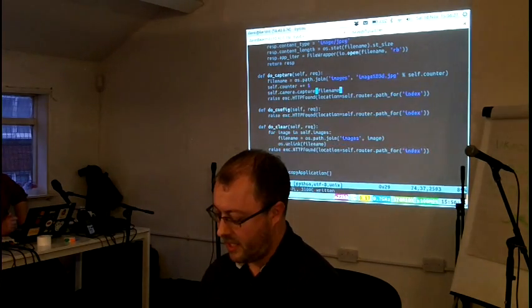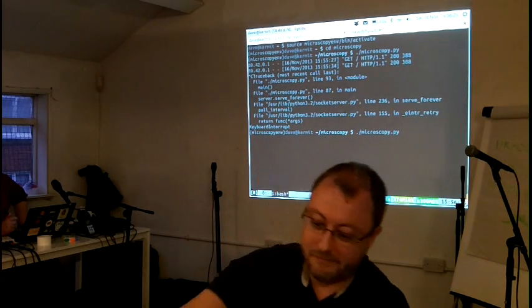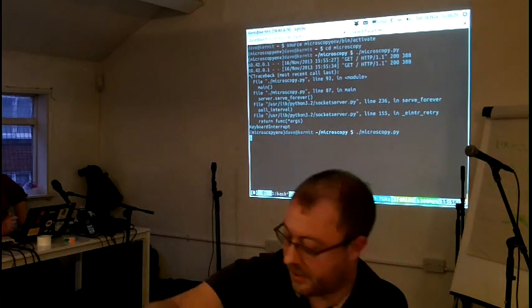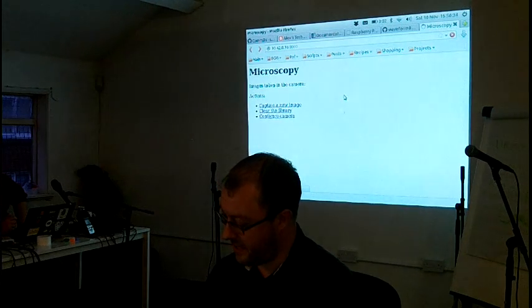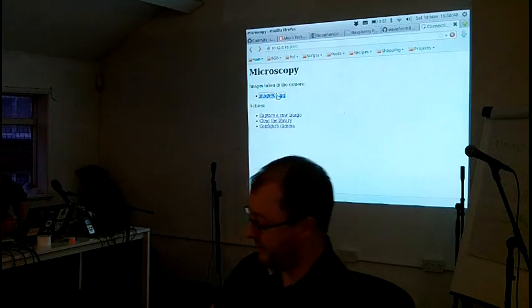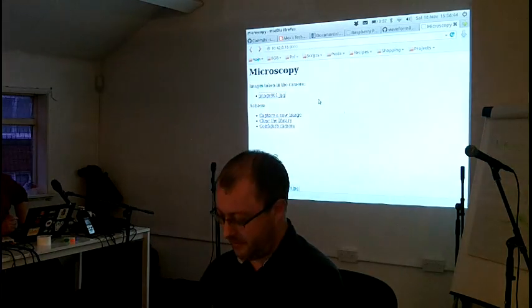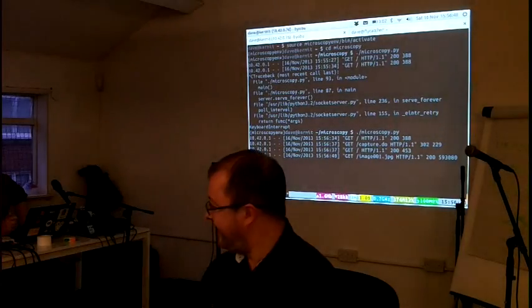So, let's try running that. You see on the screen? There we go, okay, on the screen. Let's go over here, make sure that's still happy. Can we capture a new image? Aha! We have an image. Where's the usual one? Ah, there we go. We're upside down. Dear Reddit. Right, well, let's do some configuration then.